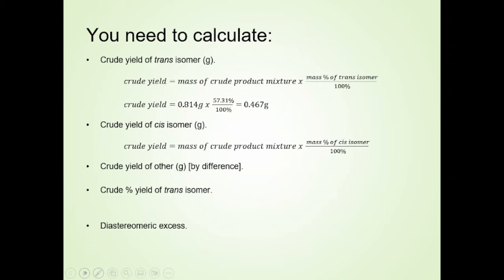And we call it a crude yield, indicating that it hasn't been purified. Usually when you say percent yield, it's implied that it's been purified. If we say crude yield, we're indicating that it's not purified, but we still know the exact amount that's present, even though we haven't purified it and separated it from everything else. And that's why we put that little crude in front of it, just to indicate this is still part of a mixture, but we have quantified how much is there.